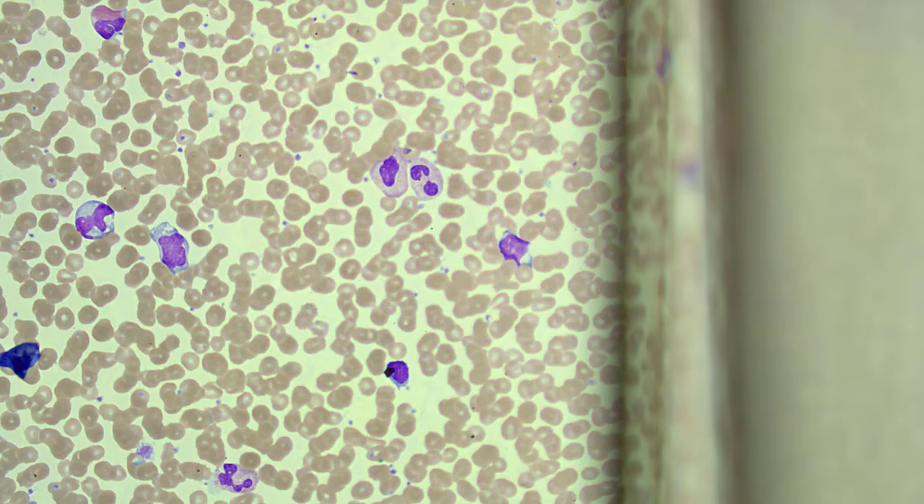A long spread might even go off the edge of the glass, and we're in danger of missing large or atypical cells.